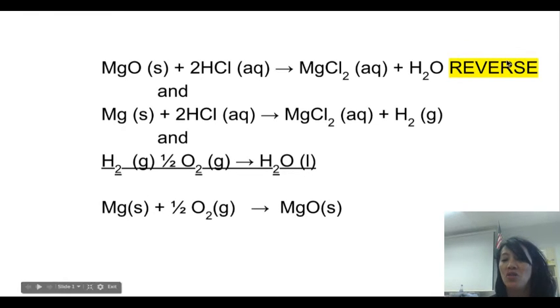We will also add up the heat of reactions after reversing the heat of reaction for the first one, and that should give us the heat of reaction. But then we need to divide by the moles or grams of magnesium reacted in order to compare it to the tabulated values. Actually, the moles, since magnesium and magnesium oxide are in a 1-to-1 mole ratio.